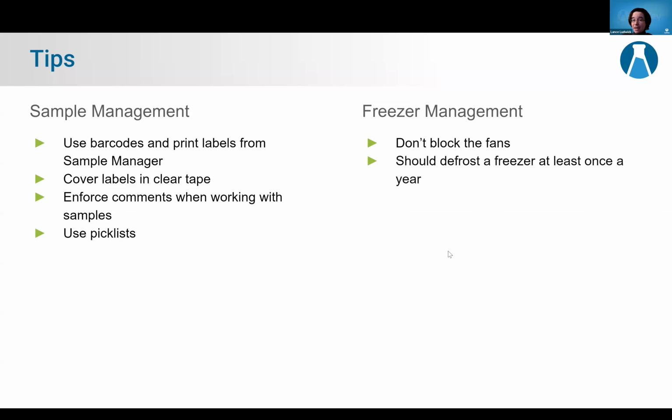Keeping up with your regular maintenance can also ensure your freezers don't die on you. Most manufacturers recommend you defrost your freezers at least once a year. So with doing that, you'll want to make sure you move all of your samples out of the freezer and into another temporary location while you clean your freezer out, allow it to completely defrost.